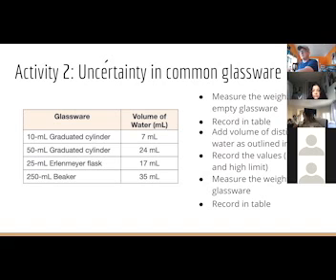That is basically what you think would be the maximum volume you're looking at or the minimum volume you're looking at, just by examining the container it's in. For instance, I'm looking at my 24 mils in my 50 mil cylinder, and each one of those check marks is 1 mil, right?